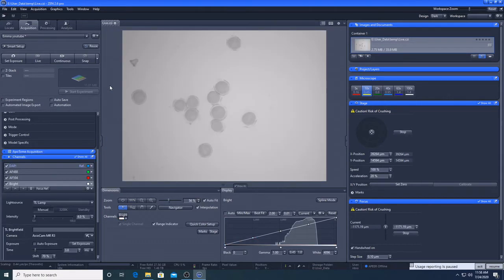Once you are happy with your settings, you can save them to your experimental profile, and you can reuse these for all of your imaging sessions.